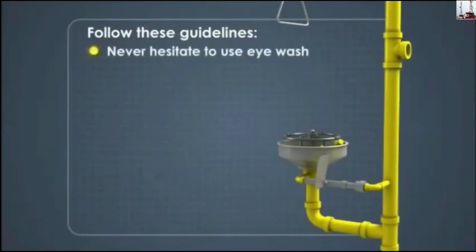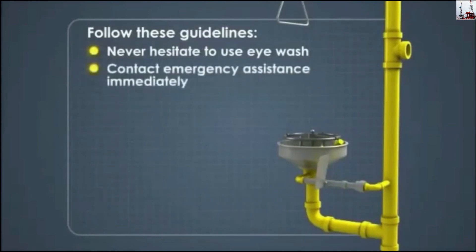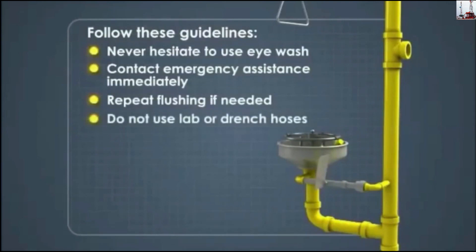Never hesitate to use an eyewash if needed. Have a co-worker contact emergency medical assistance immediately. If there is no one to ask, rinse for the allotted time recommended in the SDS and then seek medical assistance. If irritation persists, repeat the flushing procedure.